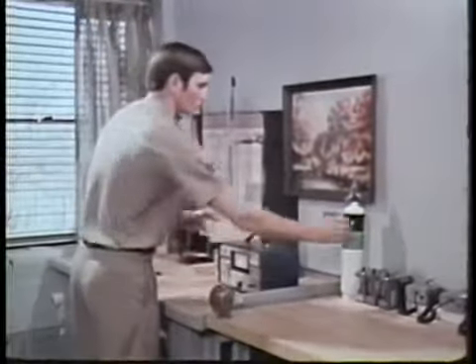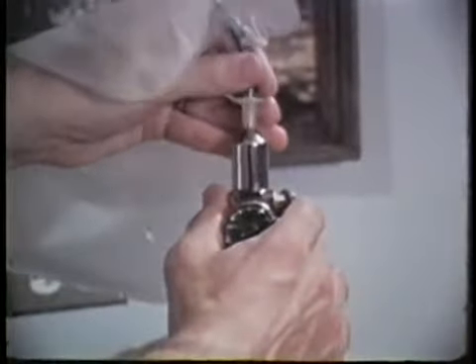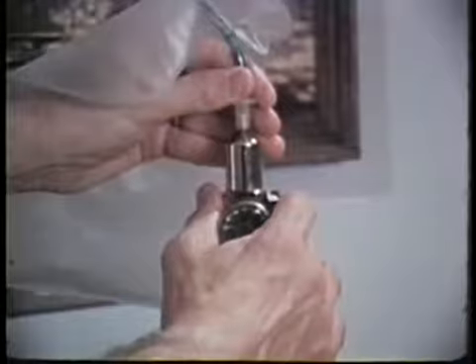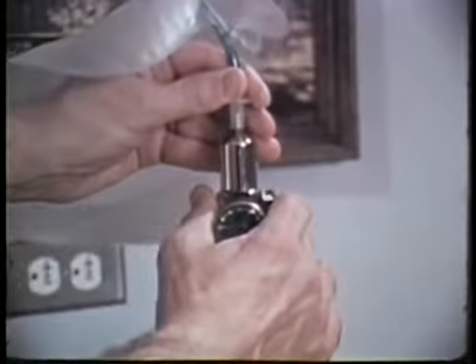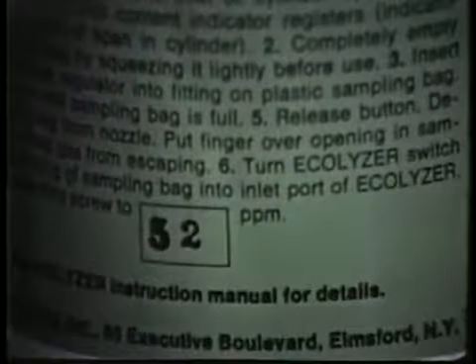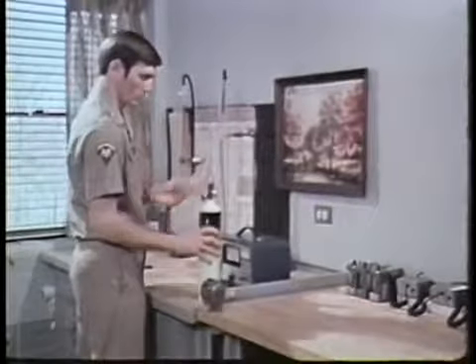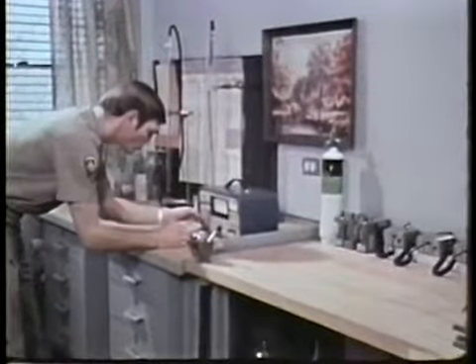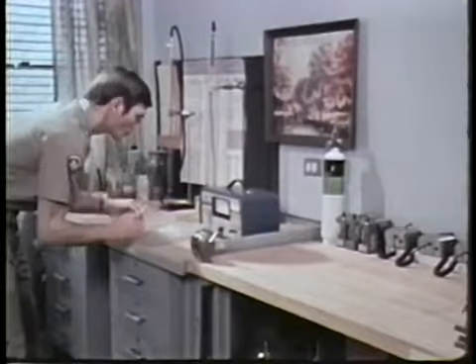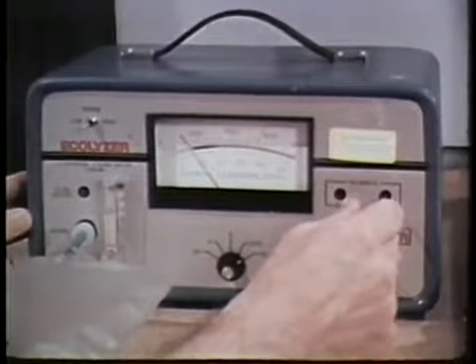This is a calibration procedure using a small quantity of the gas you'll be sampling for. The gas sample is transferred into a plastic bag. Never run it directly from cylinder to intake. You might ruin the instrument. Stamped on the cylinder is an accurate measure of the concentration of this particular gas, given in parts per million. Attach the plastic bag to the intake port of the analyzer. What you now do is adjust the meter so it reads exactly the value shown on the cylinder.